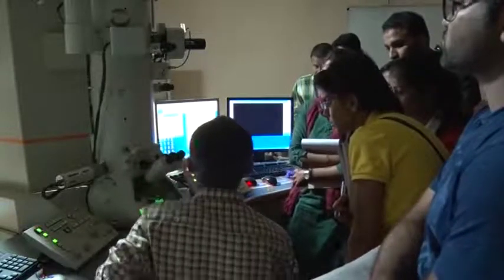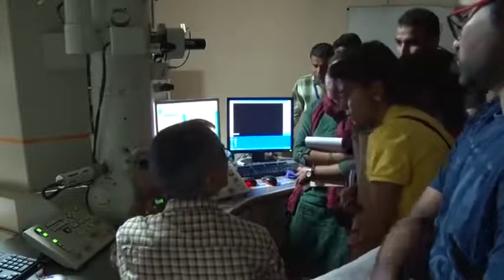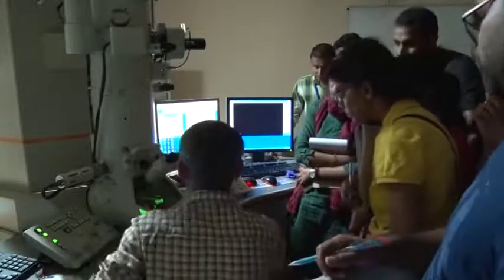Now what remains is the Z height of the sample. Till now we were not requiring the sample. Now we have to find it. We know this is the sample. There is a sharp region also, and having a sharp edge is better. So right now I think I can already bring this on the screen. You can now go back actually, all of you, so that it becomes easy for everybody.